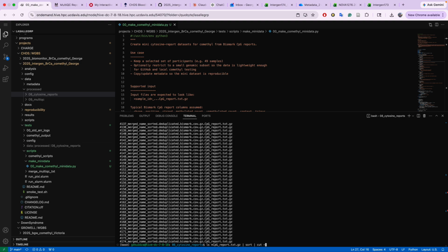Let's do cut. Cut E. Oh, damn. All right.